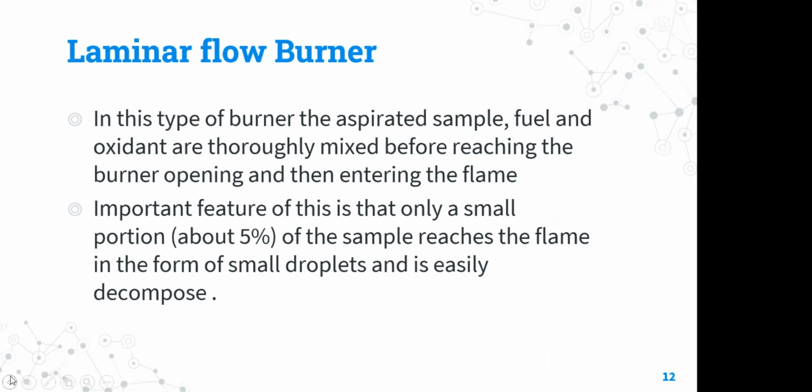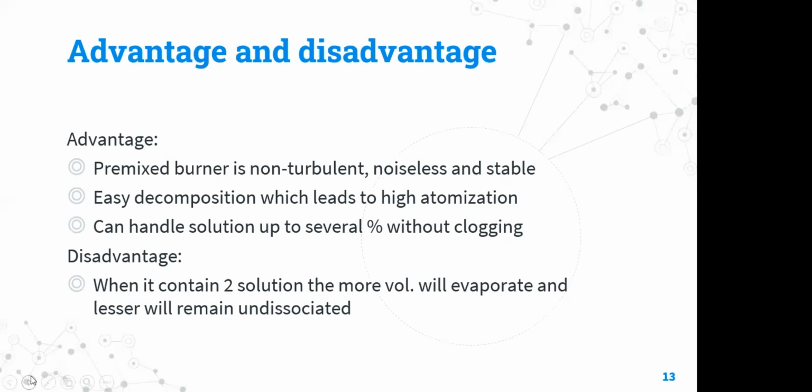Laminar flow burner. In this type of burner, the aspirated sample, fuel and oxidants are thoroughly mixed before reaching the burner opening and then entering the flame. The most important feature of this burner is that only a small portion of the sample reaches the flame in the form of small droplets that are easily decomposed.